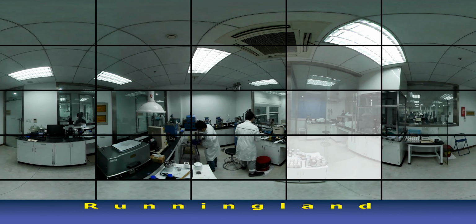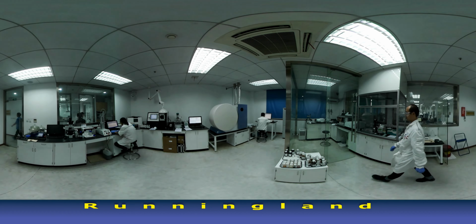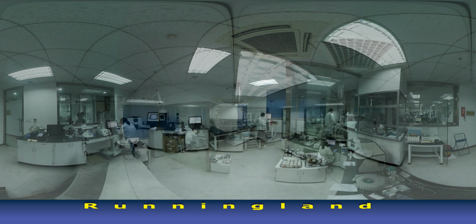Okay, so ladies and gentlemen, next to the next segment of our tour, this is laboratory number 2, where analysis and testing is focused towards wear metal detection, spectroscopy, and particle detection. In this lab, the test methods are Karl Fischer water, PQ index, particle counter, ICP-OES, FTIR, and a high-powered microscope for viewing particles.